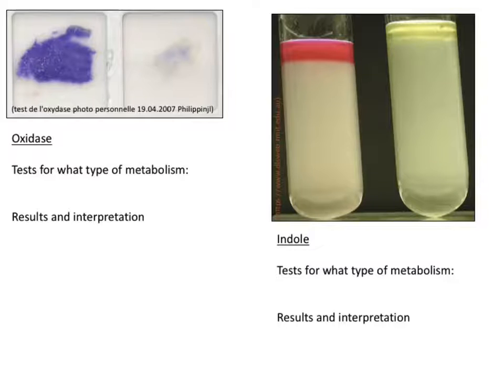And what gets produced, Dana? Indole and anything else? We didn't really talk about what else gets produced. Not necessarily. The SIM test, where I think you're probably getting that from, would test for sulfur or hydrogen sulfide production as well, but those two tests are actually independent of one another. They're occurring in the same tube, but you can have organisms that are H2S positive but indole negative, or vice versa as well. So it doesn't have to go hand in hand.